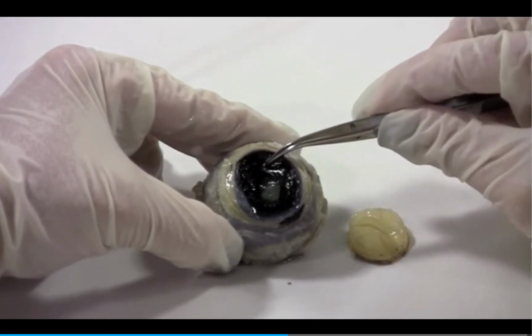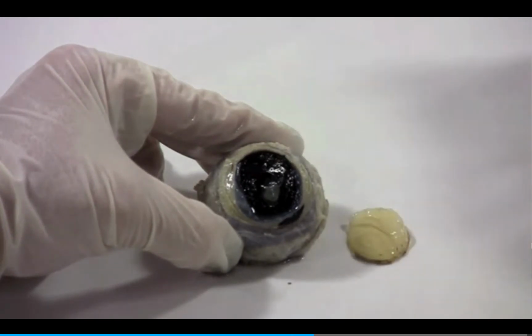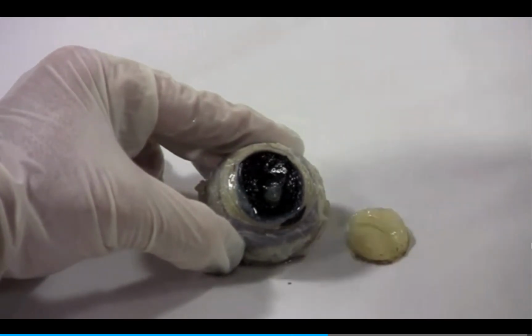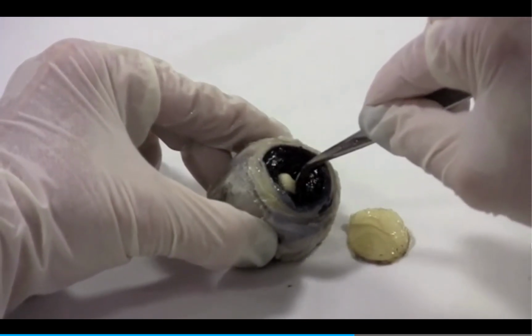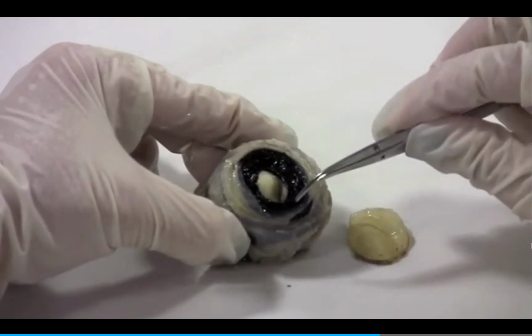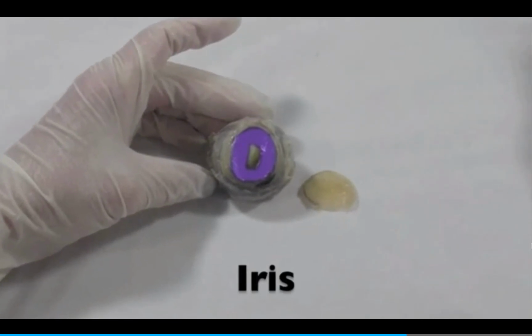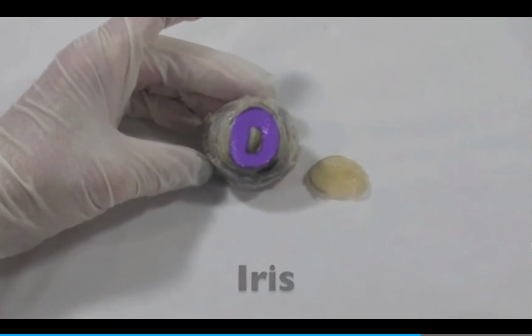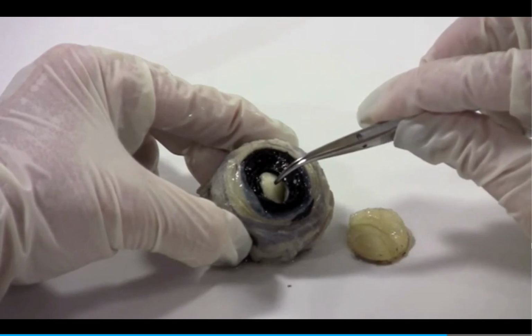The iris is the colored part of the eye. It's a muscular structure that controls the size of the pupil. Let's put a piece of white adipose tissue behind the iris so we can better see the shape of the iris. And the opening in the middle is called the pupil. Light passes through the pupil to the lens.